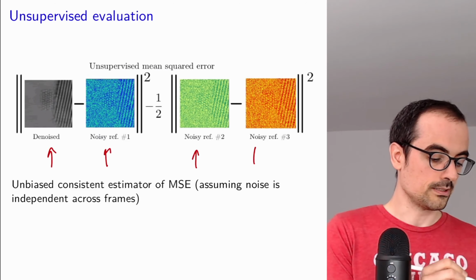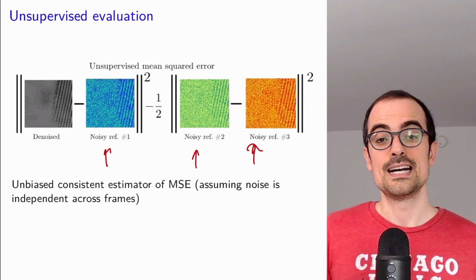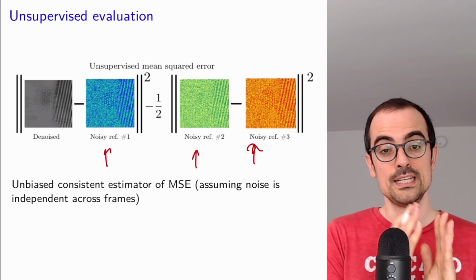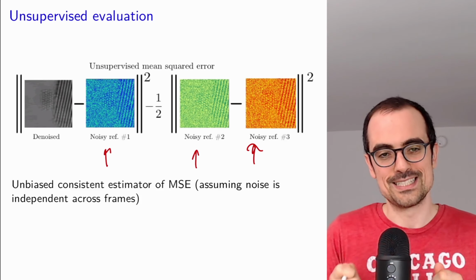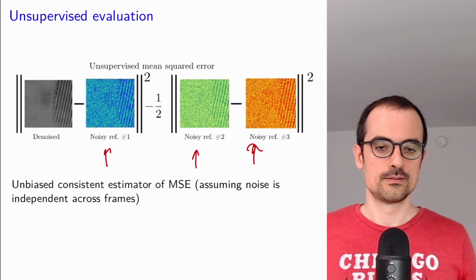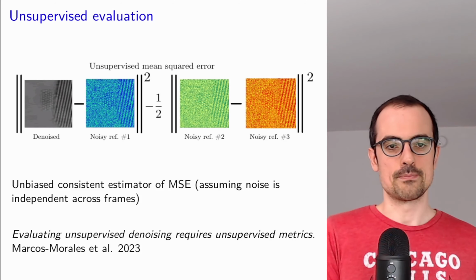And this is very important. So not here, sorry. Independent among the noisy frames, and also assuming that you have the same atomic structure in each of the frames, which is not always exactly true in practice, but we hope that it's close enough. This method was introduced in this paper.